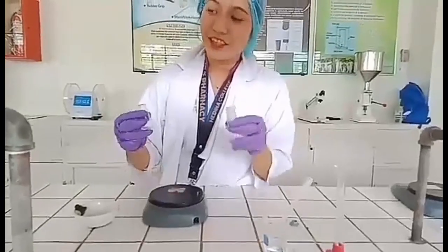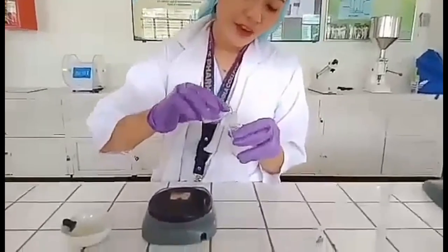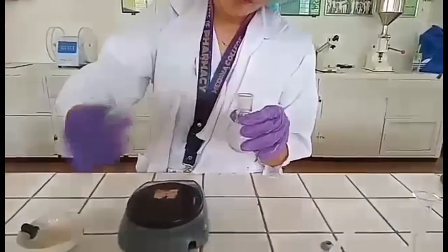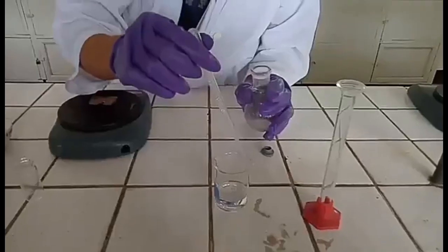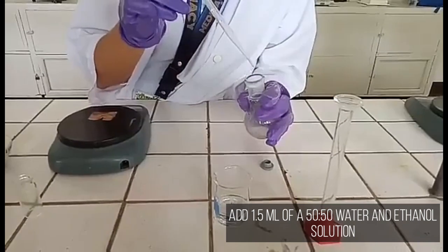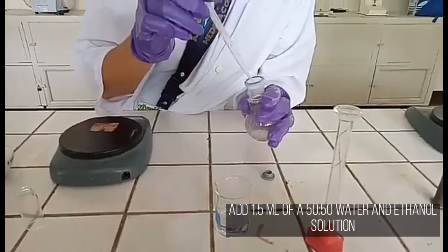First, transfer to the conical vial. Add 1.5 ml of a 50% water and ethanol solution.